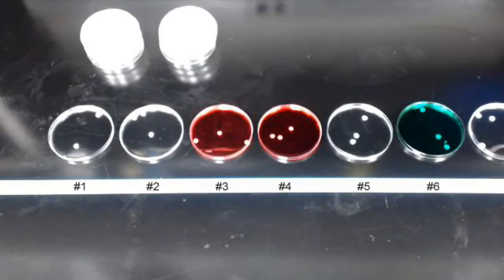Today, we're going to be performing Module 15, which looks at the effectiveness of disinfectants and antiseptics. As the introduction to your module tells you, there are many different types of antimicrobial agents. This very large group can be broken down into two somewhat smaller groups. The one group would be the biological antimicrobials, also known as antibiotics. And the second group would be the chemical antimicrobials, known as the disinfectants and antiseptics.